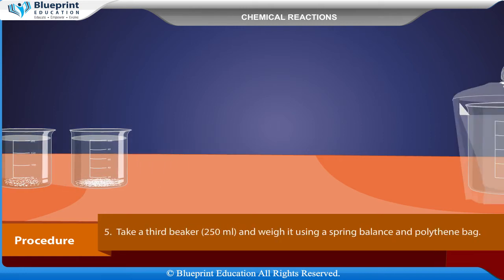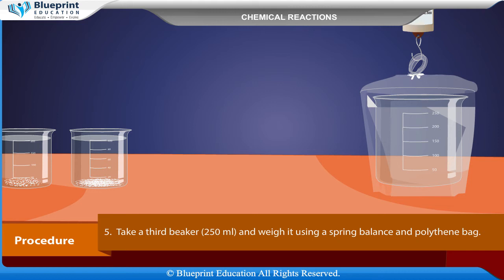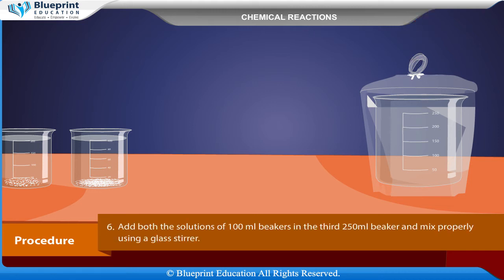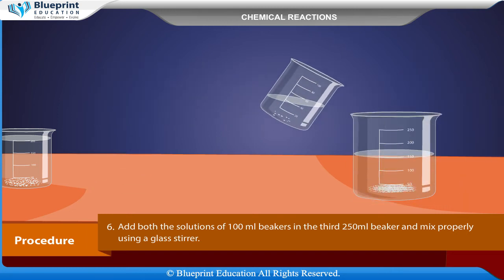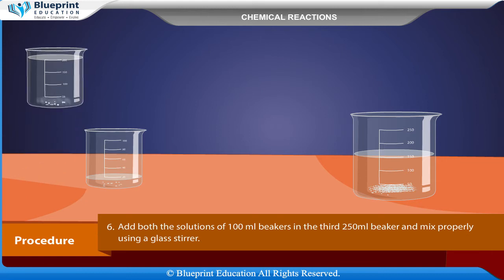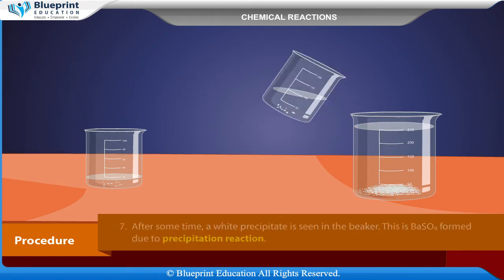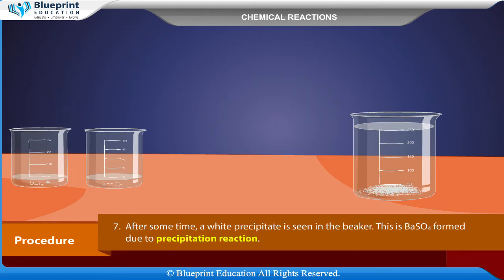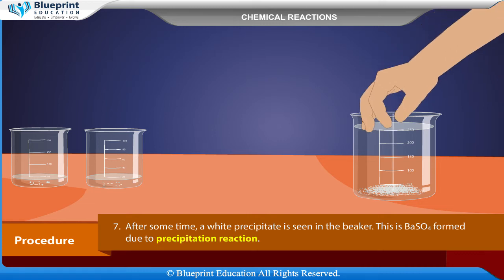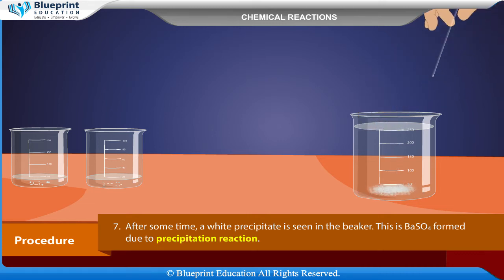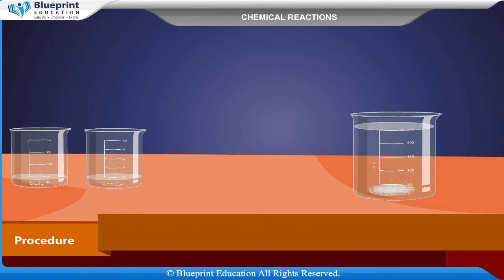Take a third beaker of 250 ml and weigh it using a spring balance and polythene bag. Add both the solutions from the 100 ml beakers into the third 250 ml beaker and mix properly using a glass stirrer. After some time, a white precipitate is seen in the beaker. This is barium sulfate, formed due to the precipitation reaction.